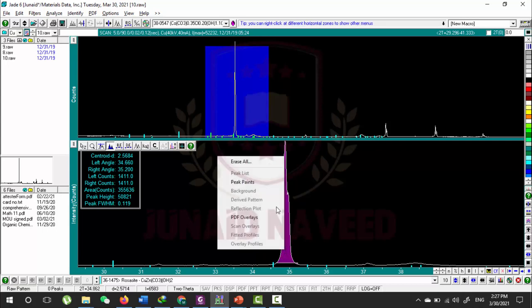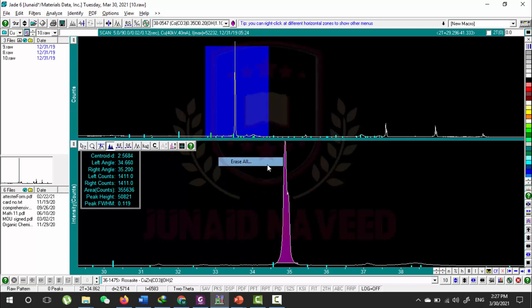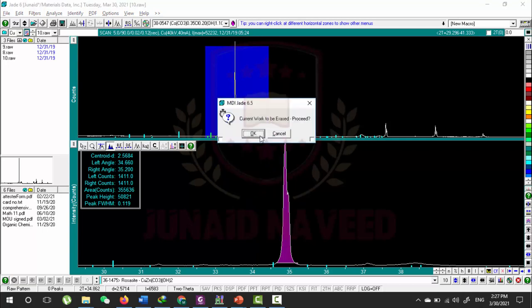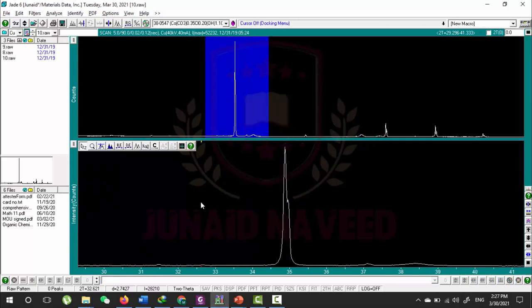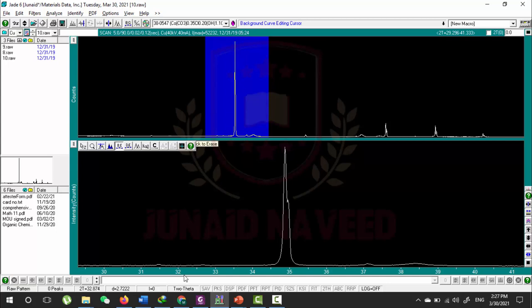If I right-click and erase all, it will erase all my previous work. This is the Background Editing Tool. There are other ways to do it, but you can also make the baseline by placing different lines. You can see.